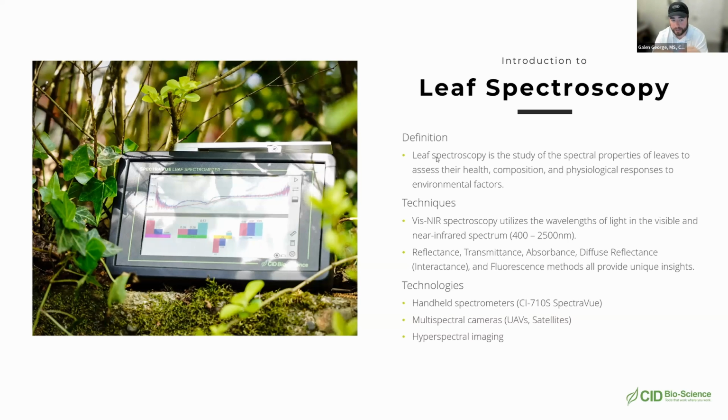Typically water is the biggest thing that is going to interfere with these measurements. Lighting conditions aren't going to impact it because this is a closed lighting environment. As far as other operating conditions, you can pretty much use it in any weather conditions you're going to encounter heat-wise. Conditions of light are not going to impact it. The biggest one is always going to be moisture.